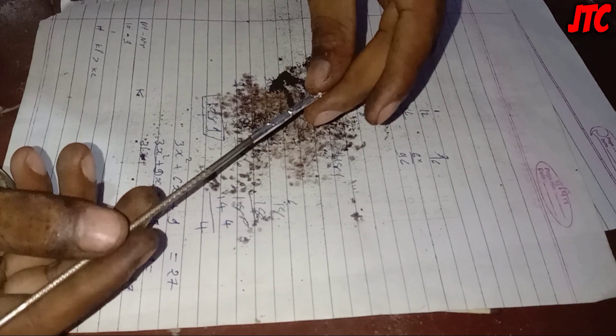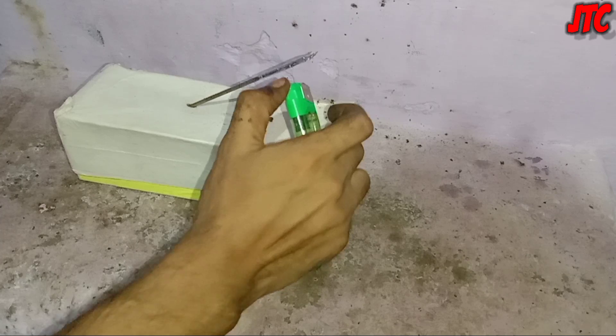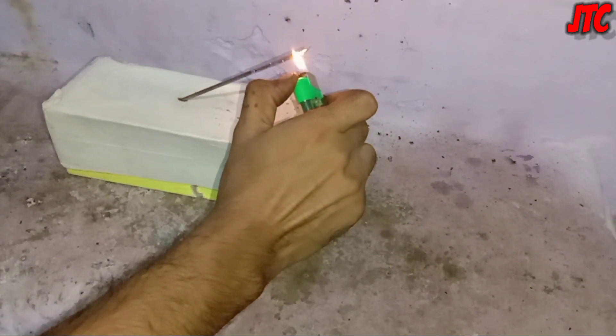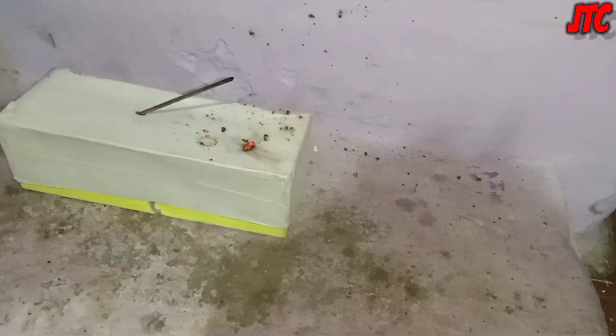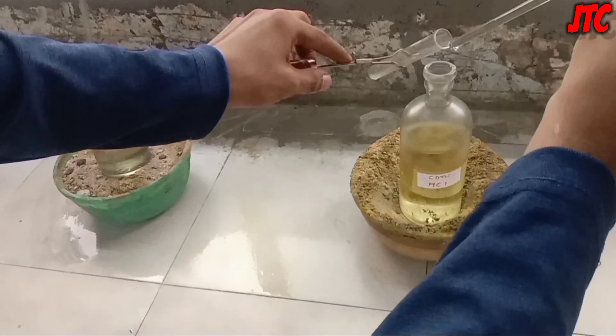Now we'll fit the rocket on the back of this needle. Now it is ready for launch. As you have seen, it launched very well. This experiment is quite dangerous, that's why we are doing it in the laboratory.